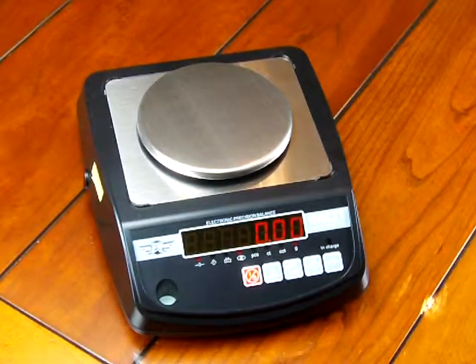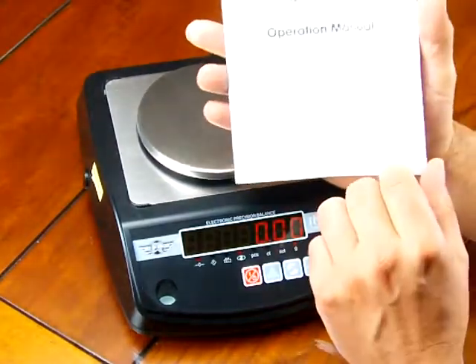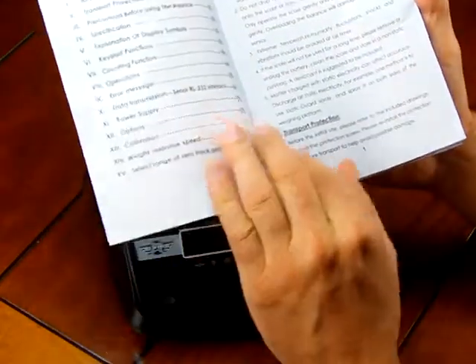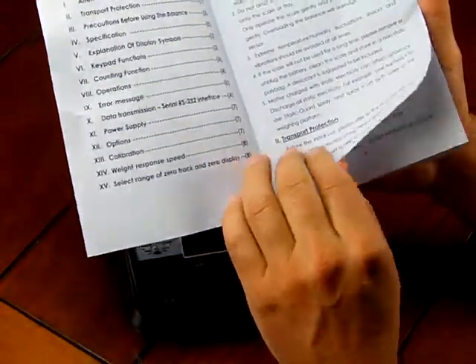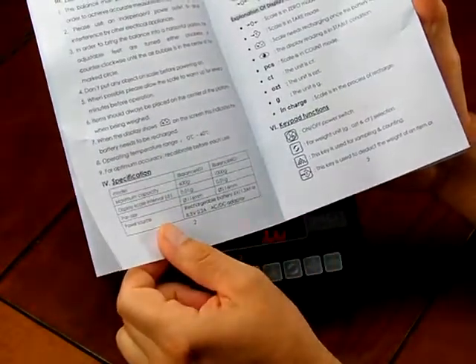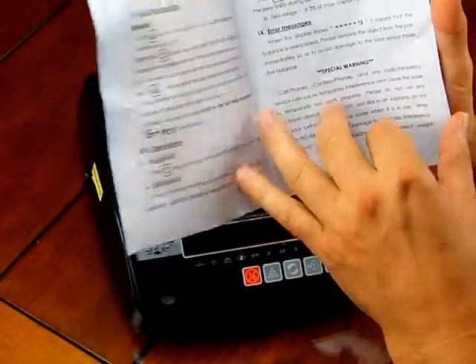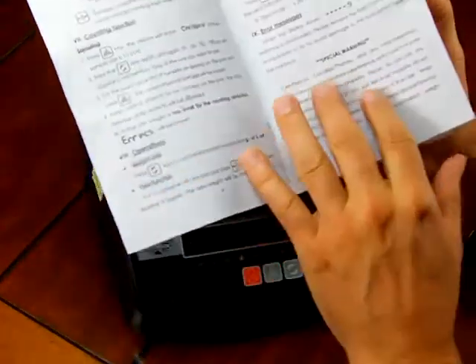There's really nothing on the market in this price range. It's a pretty impressive scale. The scale is made in China — all scales in this pricing category would be made in China. The manual that it comes with is very limited for information, and we're going to go through some of the features. The manual consists of eight pages altogether.